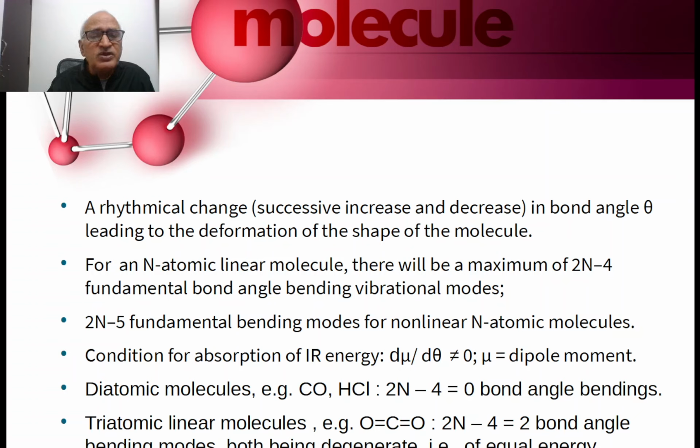It may be noted that very few molecules are linear. Majority of the molecules are non-linear, and for non-linear molecules, 2n minus 5 fundamental bending modes of vibration are possible. This is the maximum number. Not necessarily all modes are independent. Sometimes 2 or 3 modes may be degenerate, that is having equal energy.